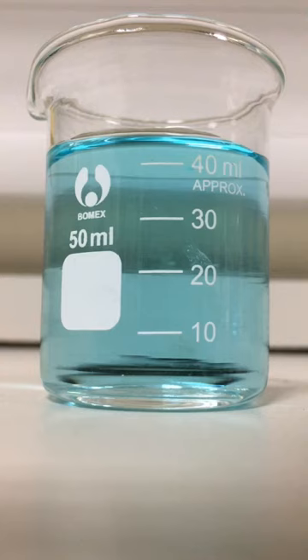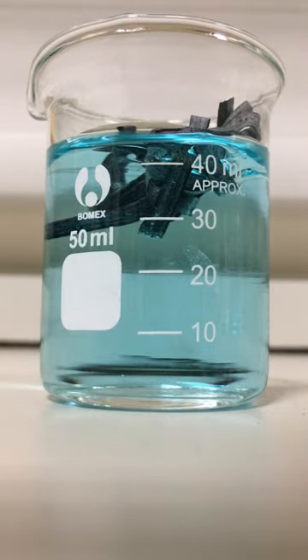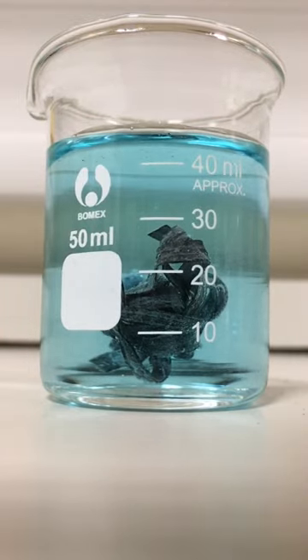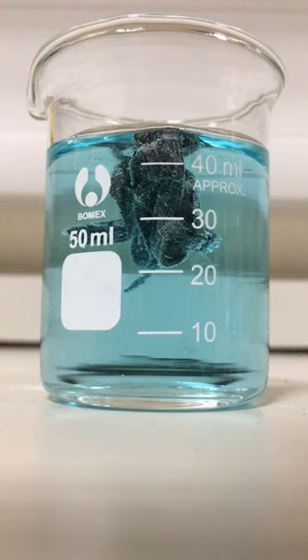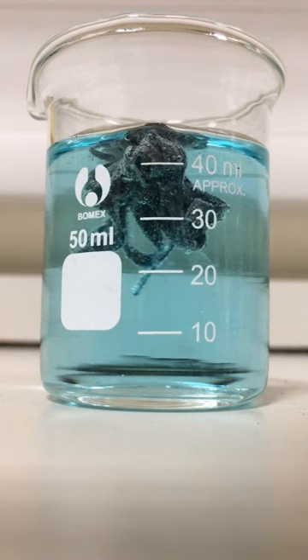Anyway, I digress. We have a nice sample of magnesium ribbon. If I throw the magnesium ribbon in, taking care of all my health and safety precautions, of course, using my hand. There is some magnesium ribbon. I will dunk, put, place, whichever adjective you choose, the magnesium into the copper sulphate. It's actually quite a dilute solution. This one is 0.08 mol per decimeter cubed.